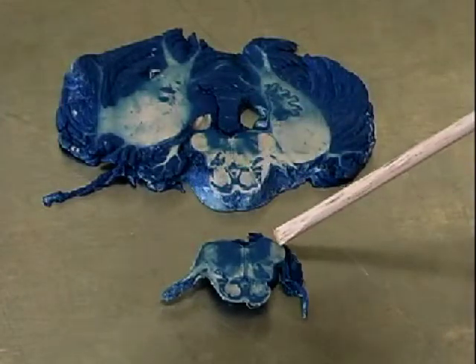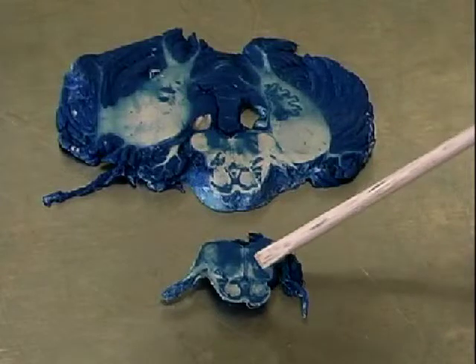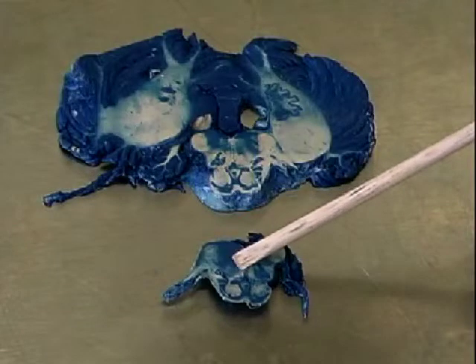Let's go down here. We've got the inferior cerebellar peduncle on both sides, some of the 8th nerve coming in. Vestibular nuclei here. Here's some olive. Here's some pons down here. Don't forget, right here on the midline, you see a beautiful medial lemniscus.